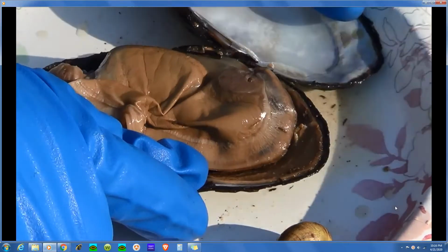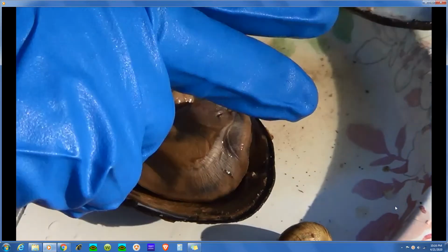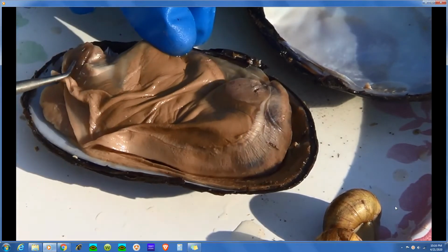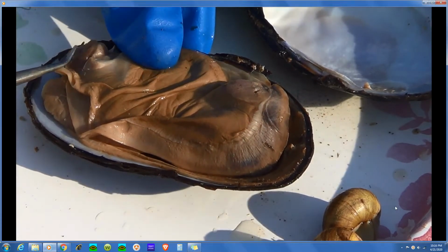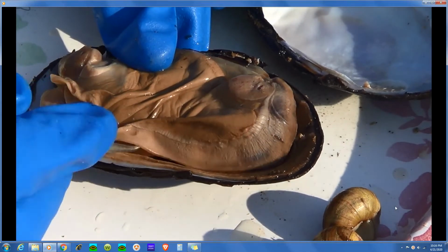set the shell so that I'll actually break it in two. So I'm going to move that piece of the shell out of the way, and now you have the body of the clam. Now down over on this side, scraped away, I have the, let's see, that would be the posterior adductor muscle. And over here I have the anterior adductor muscle. And here is the mantle.